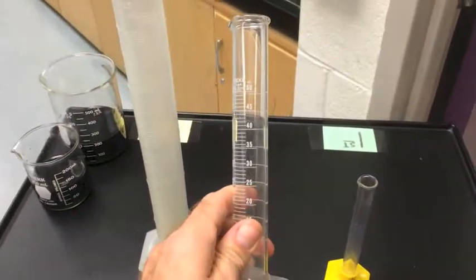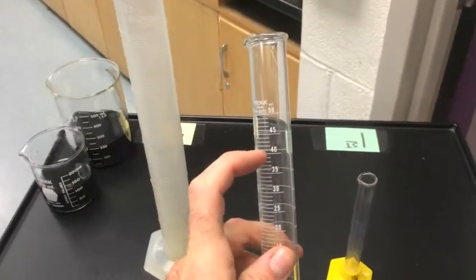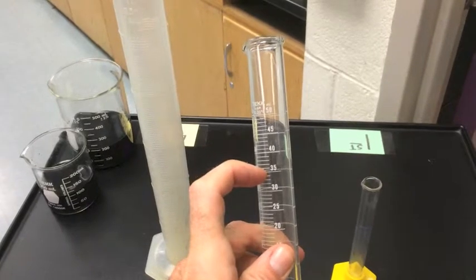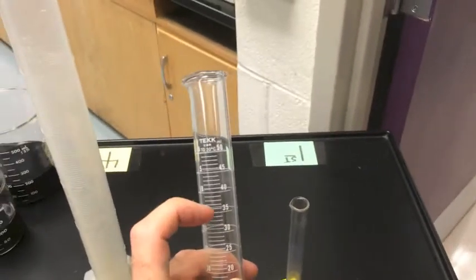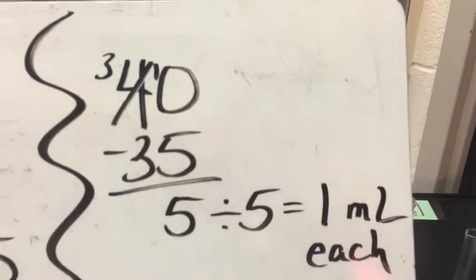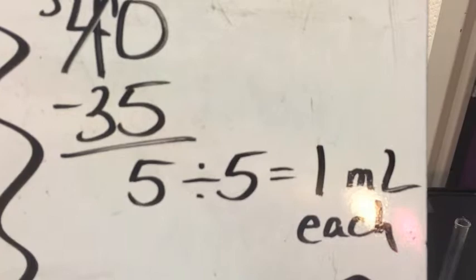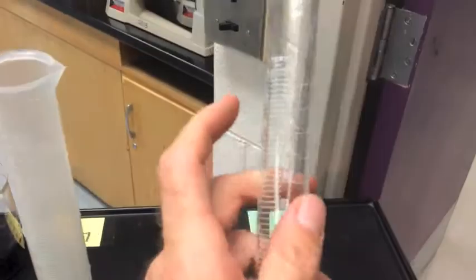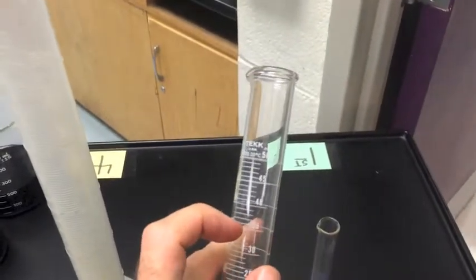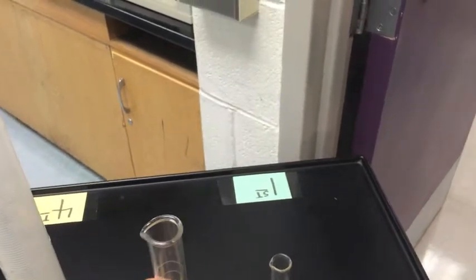This one, we're going to subtract a different set of numbers. We'll just pick some right here, say 40. Subtract the next one down is 35. And there are 1, 2, 3, 4, and 5 graduations inside. Once again, I've already done the math. 40, take away 35 gives us 5. Divide that by the 5 graduations, and that gives us 1 milliliter of each graduation. So again, that would be 35, 36, 37, 38, 39, and 40 milliliters.